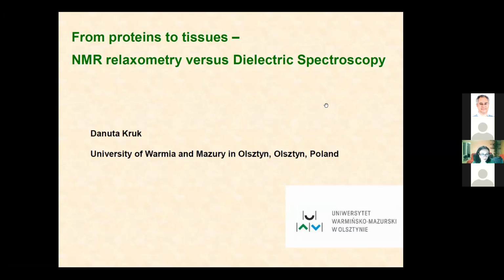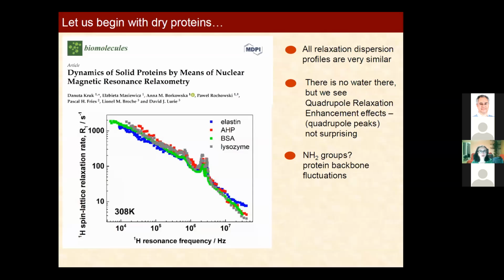You already know that one does see a lot of differences, and actually I will have a very interesting lecture about that. However, we are responsible for the work package, which was more or less referred to as studying model systems. So we started with model systems. For model systems, we thought that proteins are perfect model systems. People study proteins using high field NMR.